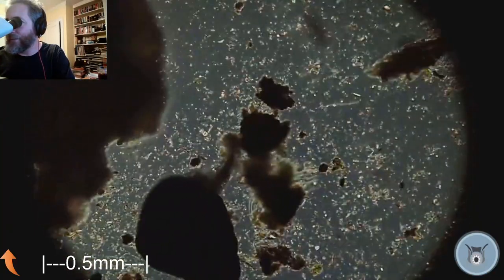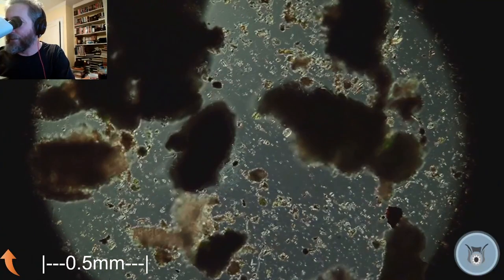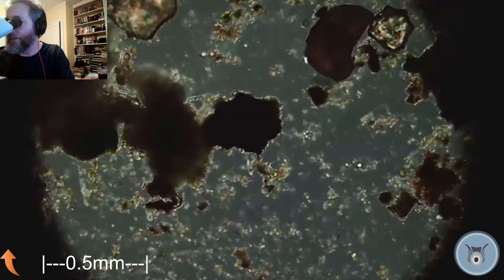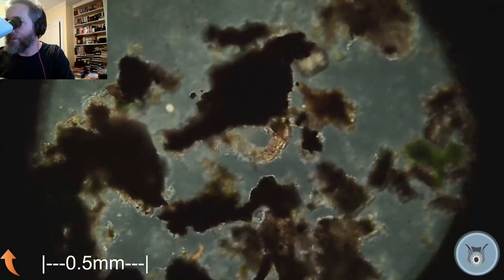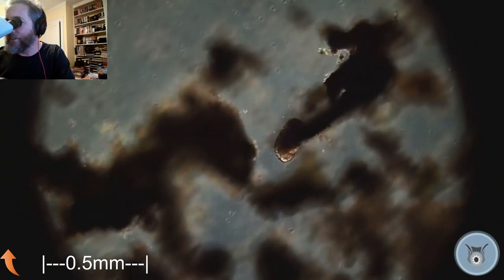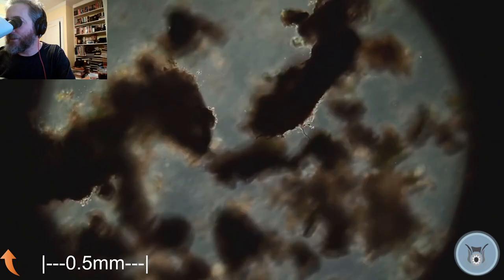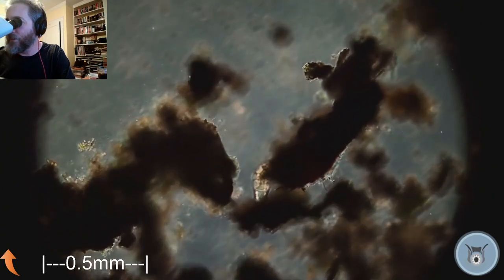And the female will lay eggs. They do not need to be fertilized. They are clones of the mama, and they will just make their own. They just clone themselves basically when they want to reproduce or when they have conditions that allow them to reproduce. And they've managed to be that way for 75 million years. Think about the success required of an organism to be around on planet Earth for 75 million years. And then add to that that they haven't had sex. They've just basically had one line responsible for each one of those organisms that leads back to, you know, they're all clones.